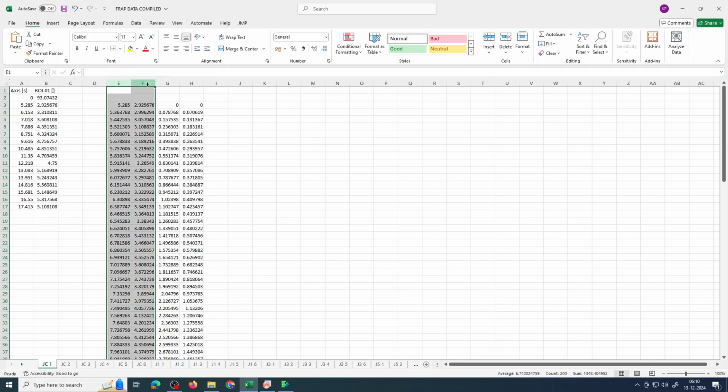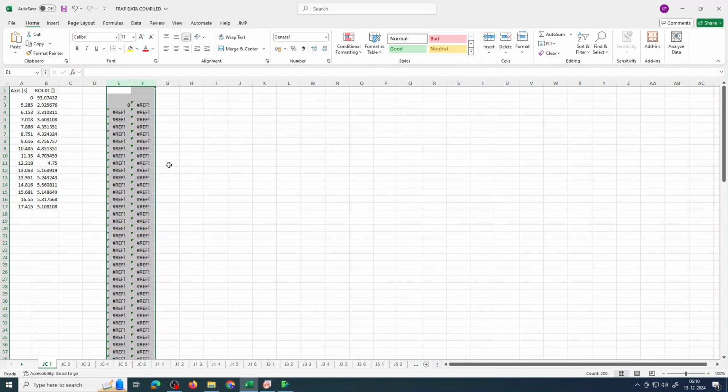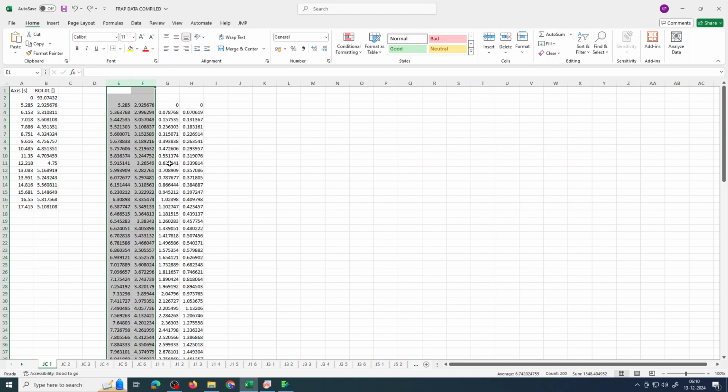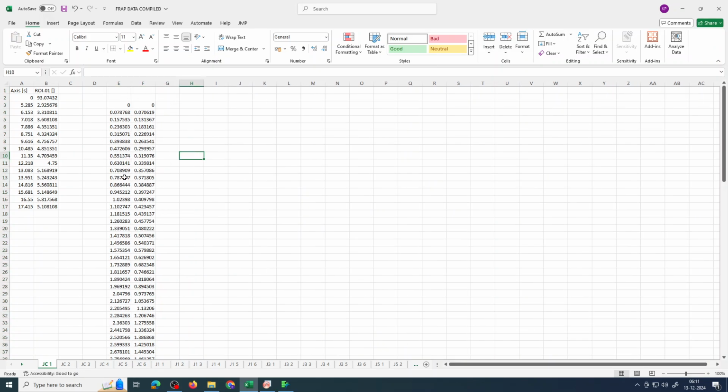The other columns will not be required, therefore we will delete them. But as the formula depends on those values, we will simply do Ctrl Z. Then we will select them, copy, and paste the values. Now we can delete it without any problem. This represents your data. Now we will mainly model the initial part, that is 6 data points, 1, 2, 3, 4, 5 and 6. So Control C, and then Control V.